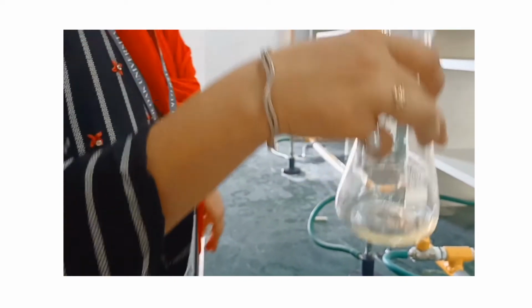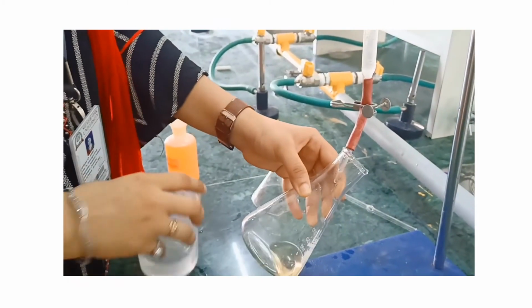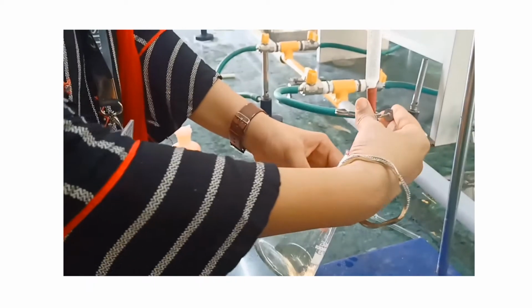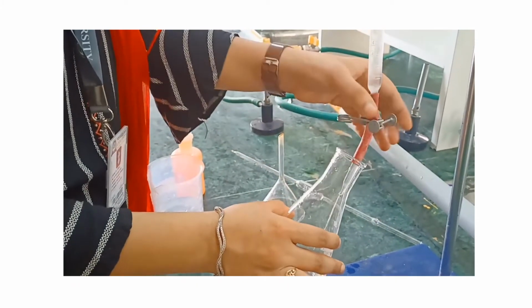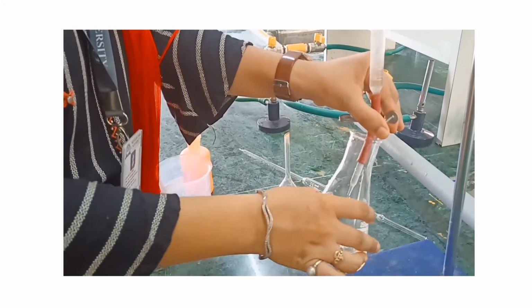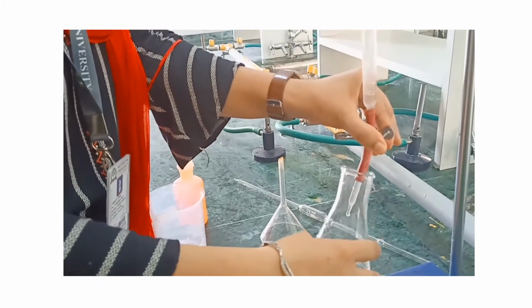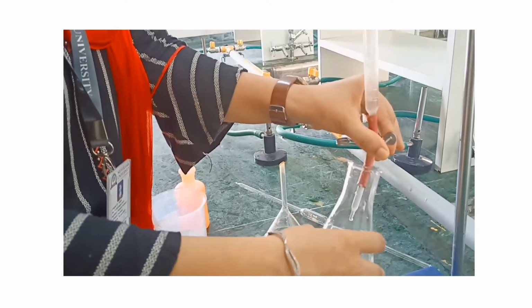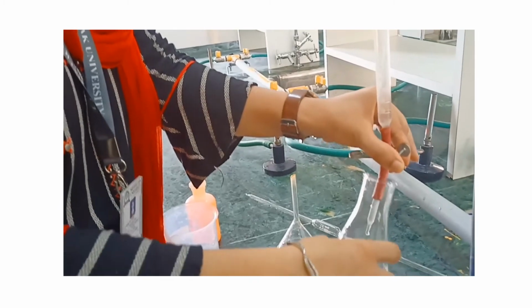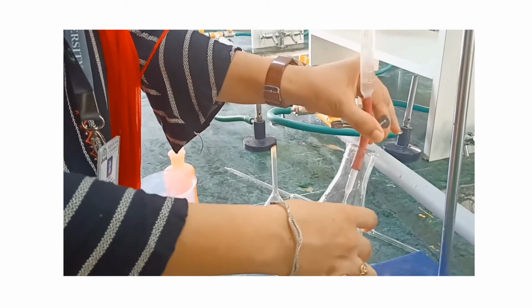So now let us titrate it and see the color change. So we will titrate with the help of the burette. You can see that drop by drop solution is added to it and there will be constant stirring. Add till the color changes to pinkish red.